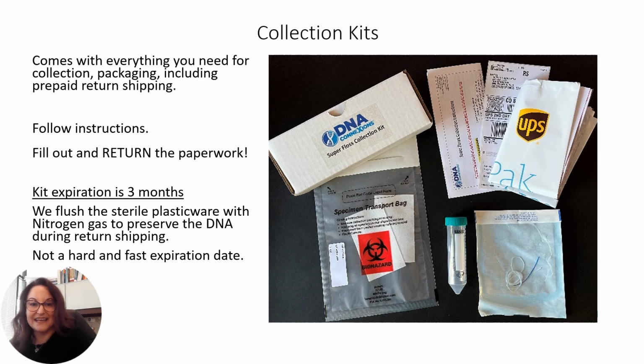Please do not add anything to the plasticware. This includes water, formalin, saline, etc. The only thing that you should be sending us is the sample that you want tested.